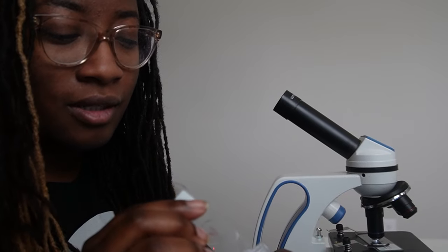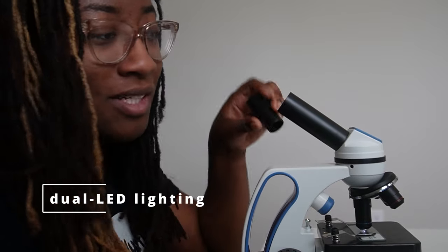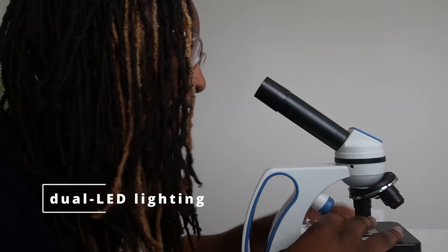So those are our three slides. One cool thing, just so you don't think that the microscope doesn't work, because it does, you just have to make sure it's on the right light.